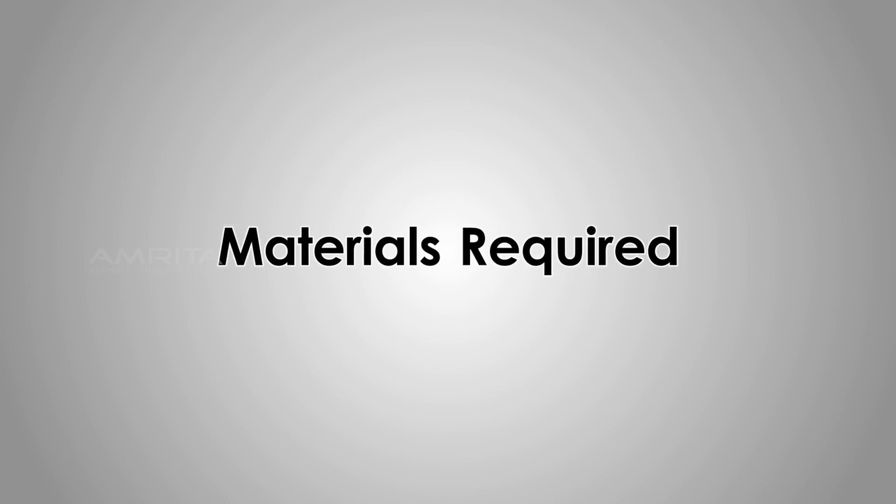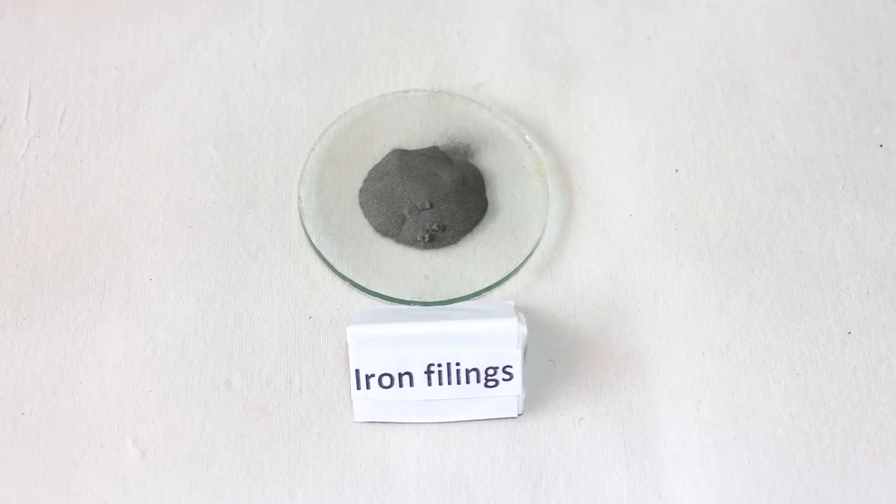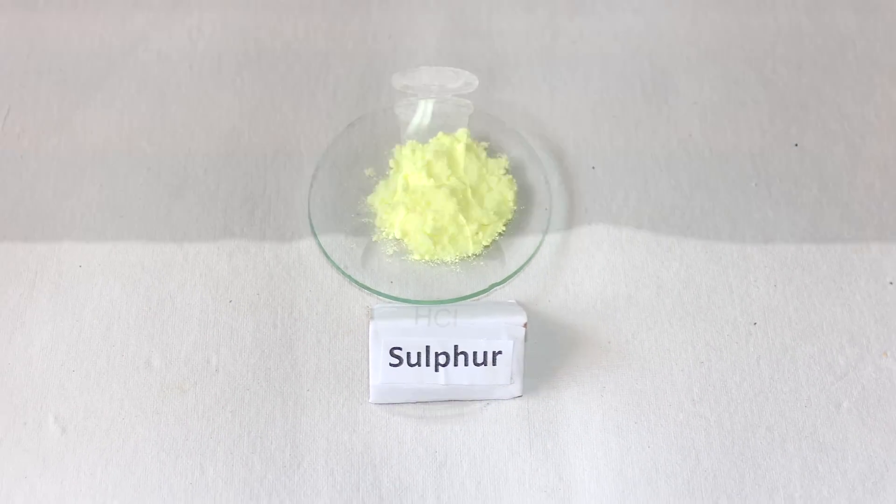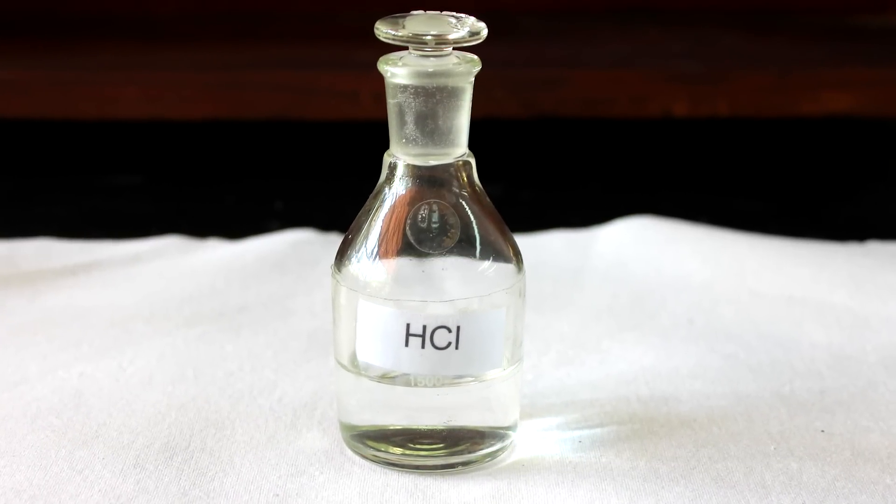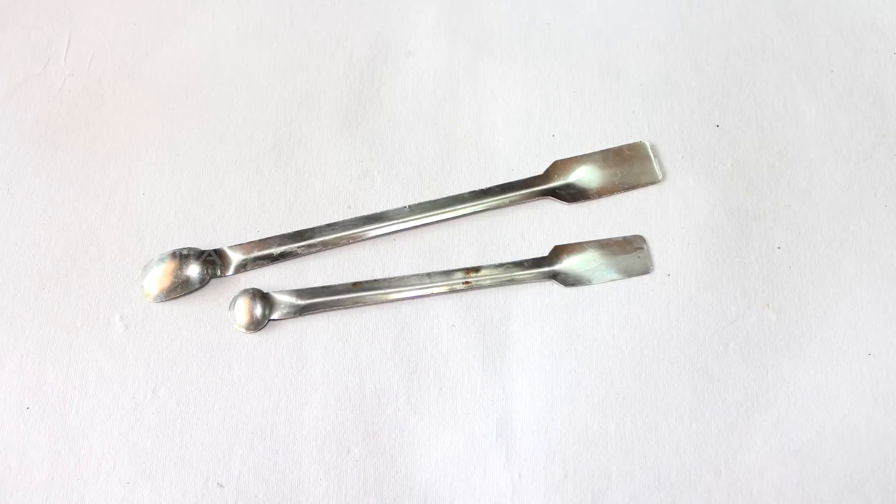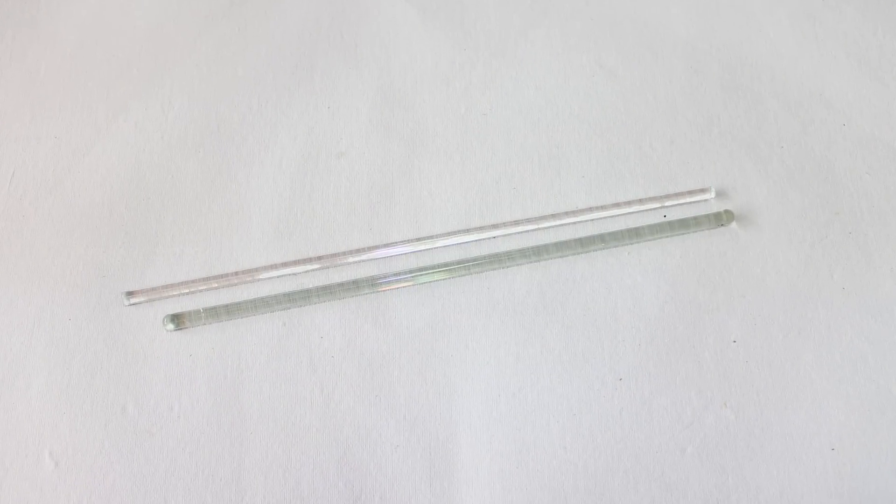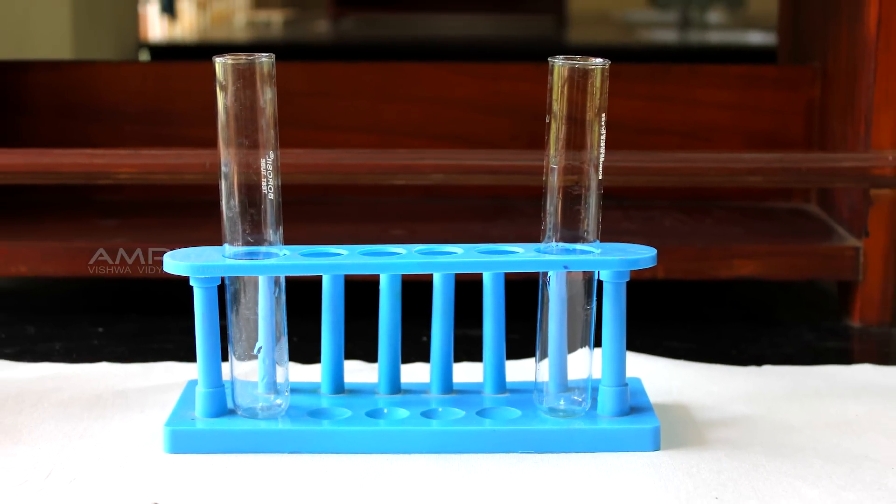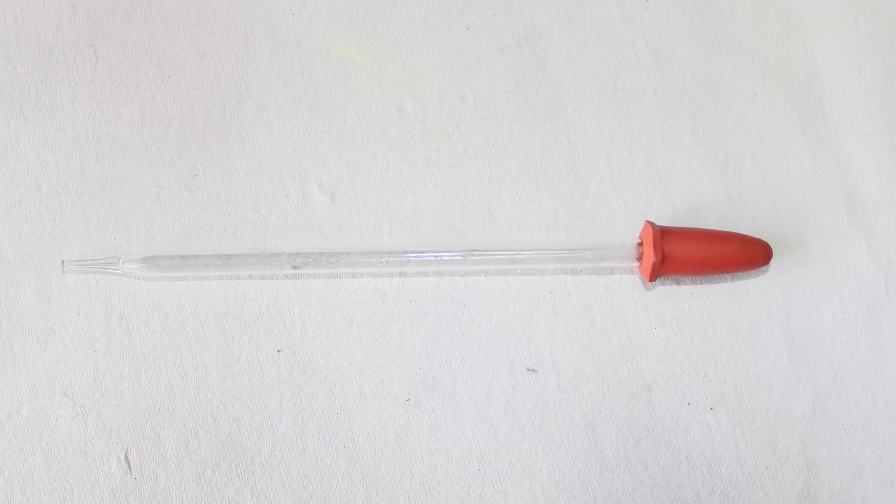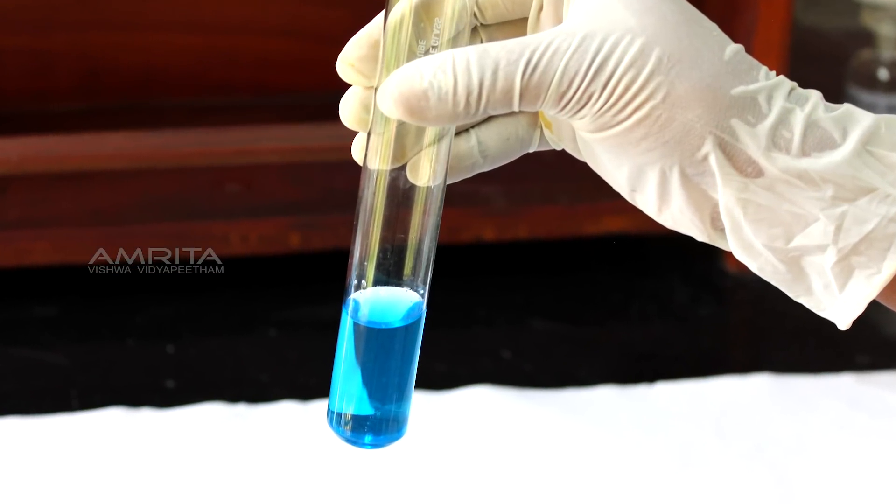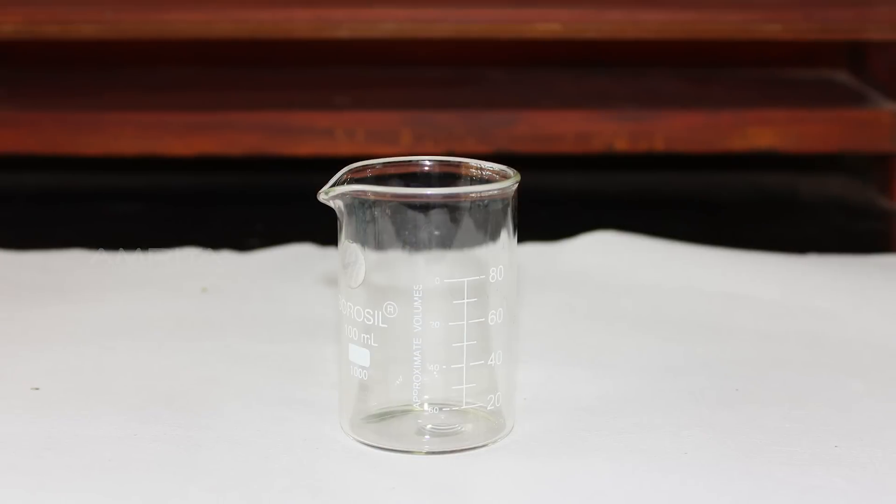Materials required: Iron filings, sulphur powder, dilute HCl, carbon disulphide, spatula, magnet, glass rods, boiling tubes, dropper, watch glass, aqueous solution of copper sulphate and a beaker.